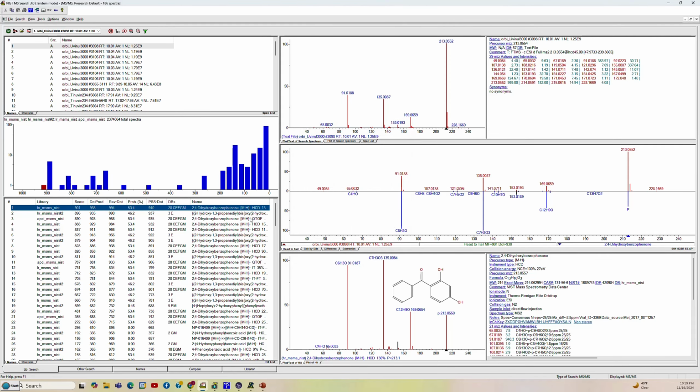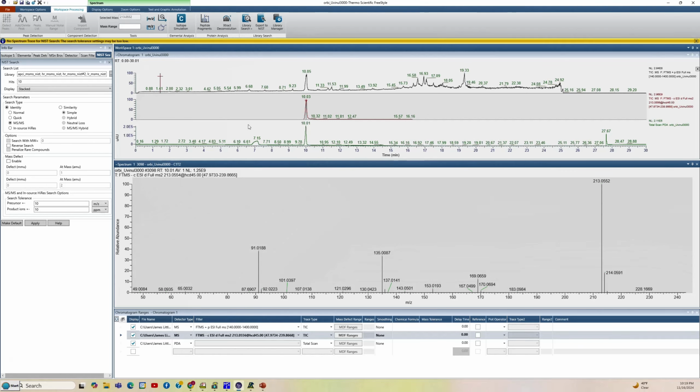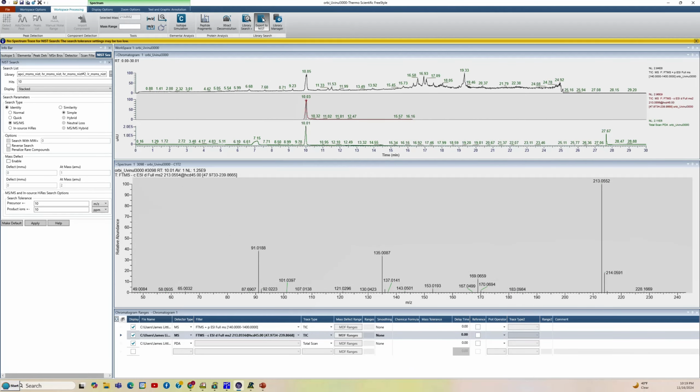So it'll save that. We'll just go back and import it one more time just to make sure it's working properly. So export to NIST again, going up to the top after I selected the bar.